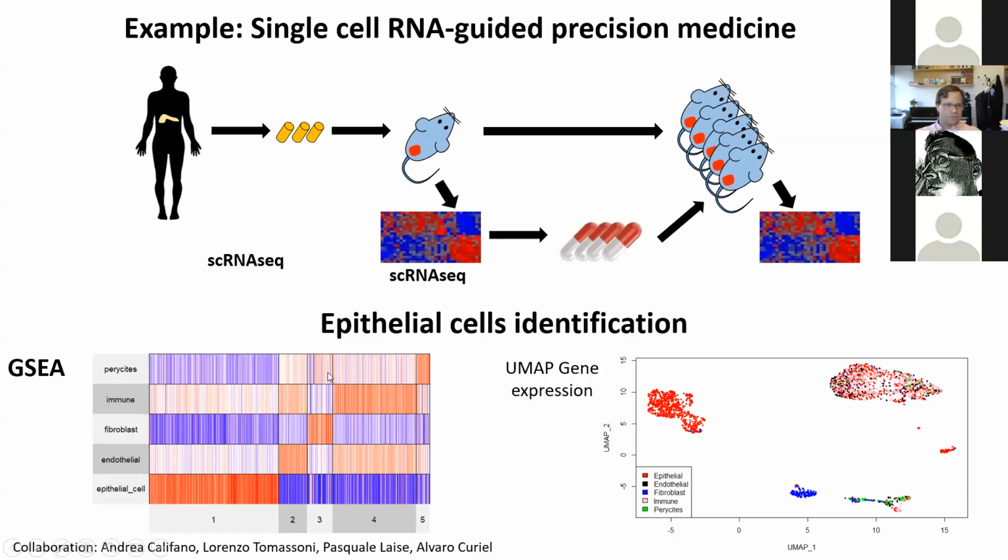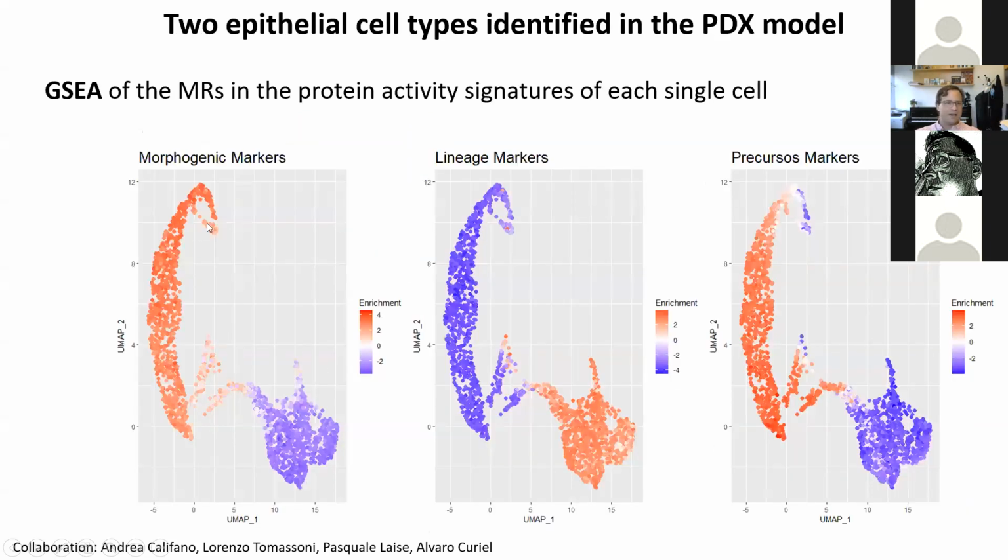And so this is just a first slide showing how we could identify the epithelial cells specifically. They're in red here, and then we focus our analyses just on those red cells. When we look at just the epithelial cells, we see two major clusters of cells. They align with two of the three major cell types that we have identified across large numbers of human pancreatic cancer single-cell data sets, again in collaboration with Andrea's group, and then we predict drugs that match these populations.